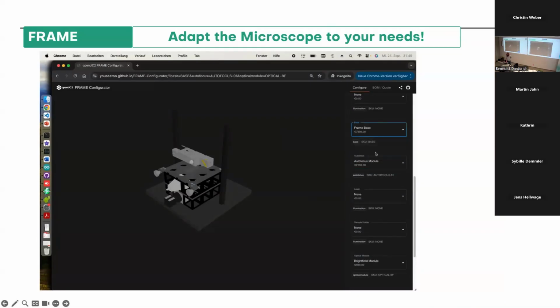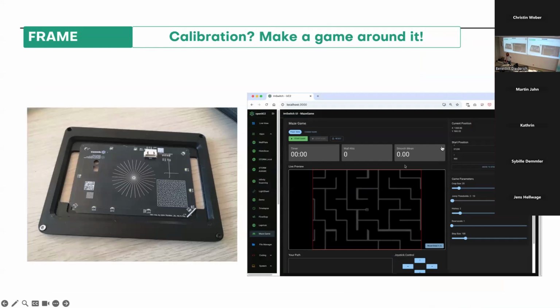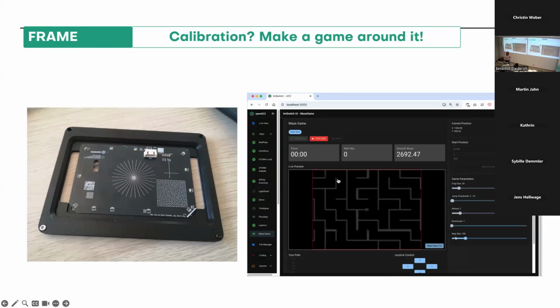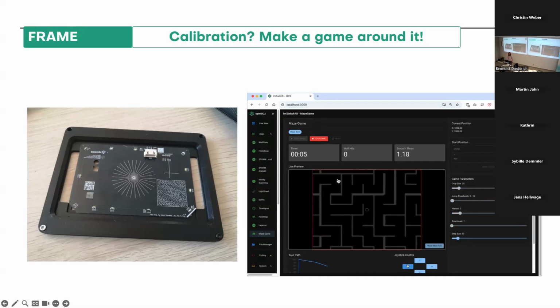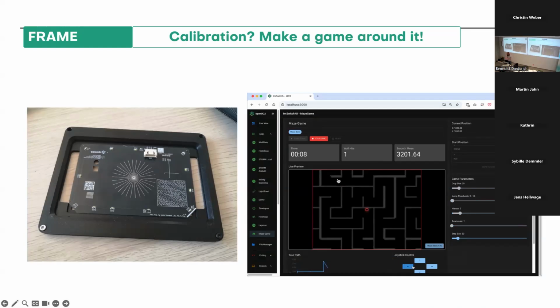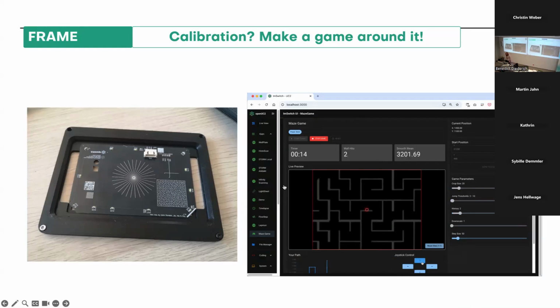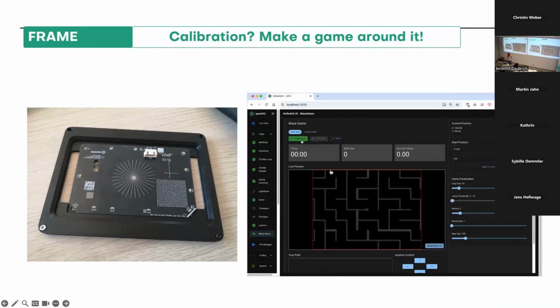Other things that we're working on, but I figured out that at least this part is missing on the table today. We have some autonomous or automatic calibration routines because people are asking, okay, you have this microscope, it's cheap, but is it also a valid research tool? That's a very valid question. And for this, you need to have calibration tools to actually be quantitative. And there are some software pieces inside this box here. I think most of the stuff is still kind of experimental, but we're converging to something that's production ready. But the microscope is optimizing itself so that you have, for example, automatic point spread calibration, and the stage is calibrating itself. And we thought it would be fun to make that a game.